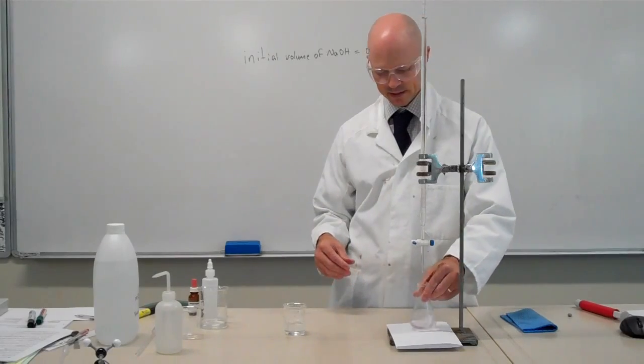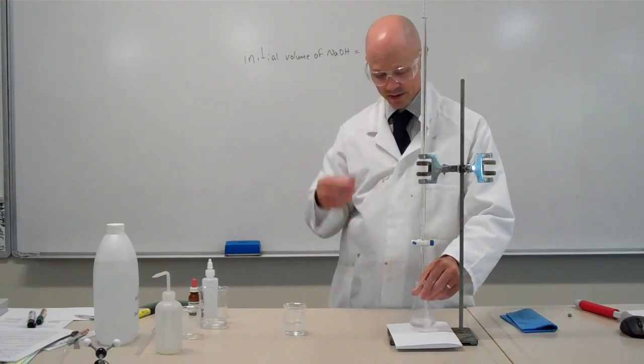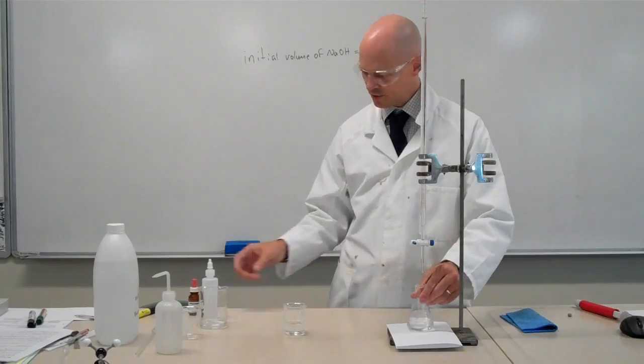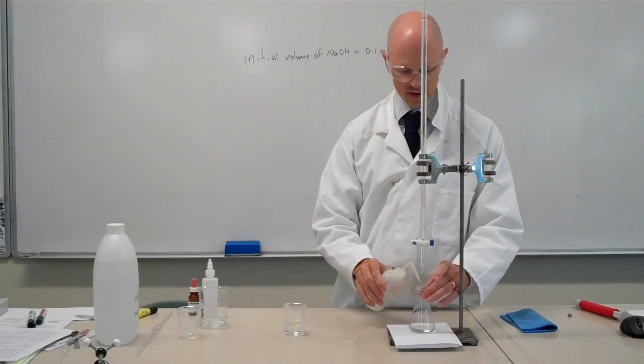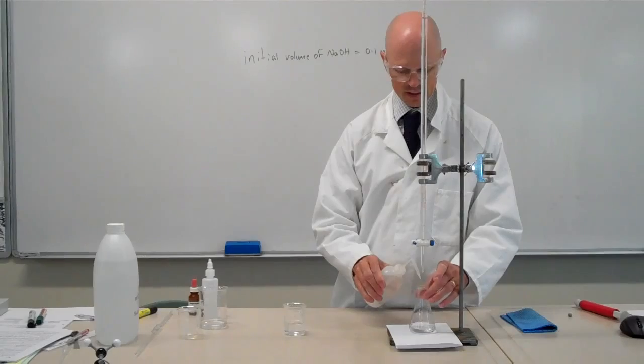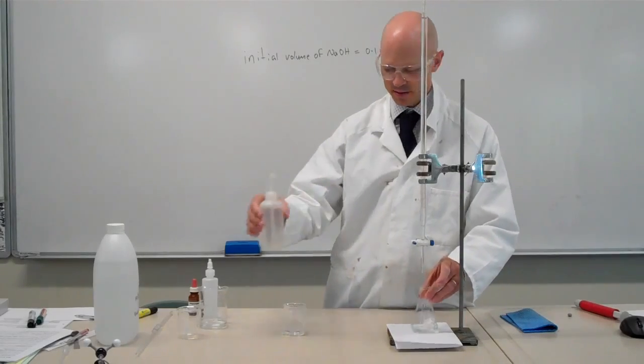The longer it takes for the pink colour to disappear, the closer you know you are to the end of the titration. I'm going to use a wash bottle to wash around the edges of my conical flask, just to wash down any splashed sodium hydroxide.